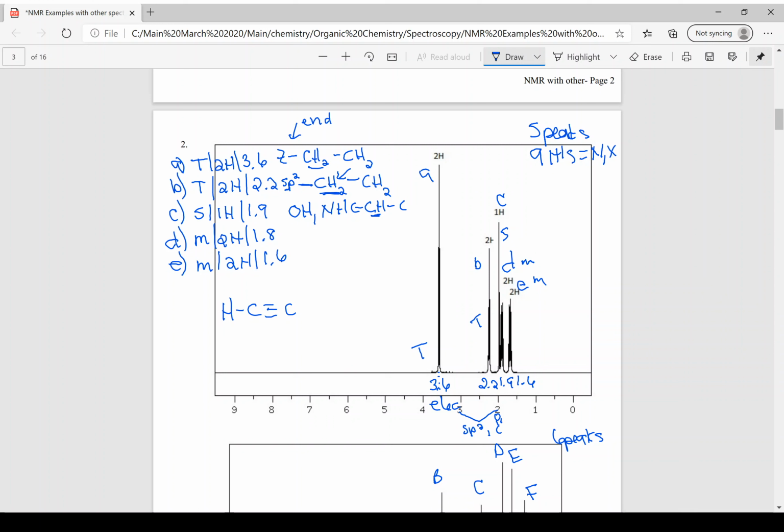And so this takes care of 1, 2 carbons. And let's add some CH2, CH2, CH2. So let me see, 1, 2, 3, 4, 5, 6. All right, let's make sure there's 9 hydrogens. 2, 4, 6, 8, 9. All right, that looks like my structure.